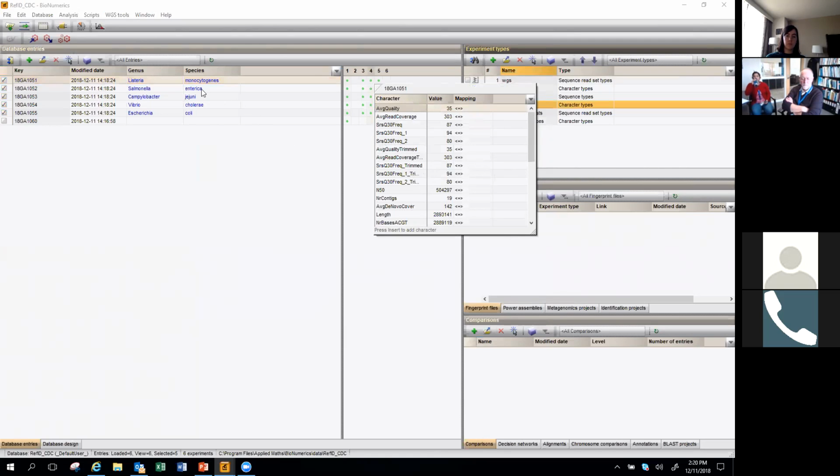So that's kind of the same check that you would do for all the organisms, and we will post a sort of a quality metrics chart to get you acquainted with what values to be paying attention to and what numbers you should be looking at. And for the analysis certification that has just recently opened up to the laboratories, that's part of the analysis certification, so you'll be able to see that in the SOPs.